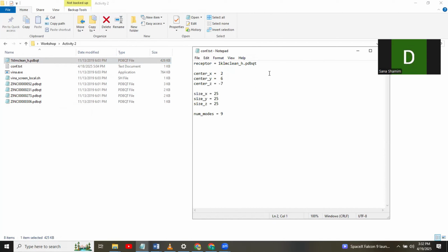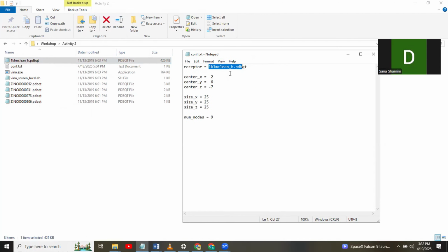If at some other time you are going to perform the same molecular docking and virtual screening, use the same text file or make changes just to the receptor and so on. These configuration text files and the shell script files are case specific, and they even take the extra space into account. For example, if I make this space less, it is going to disturb the identification of the molecule. So it has to be used as such.